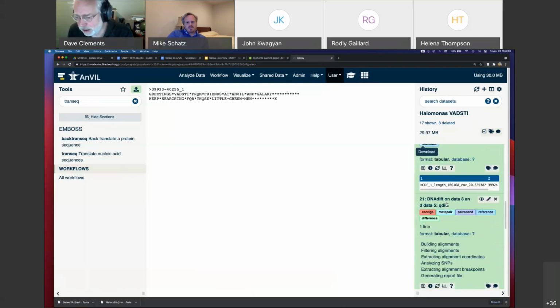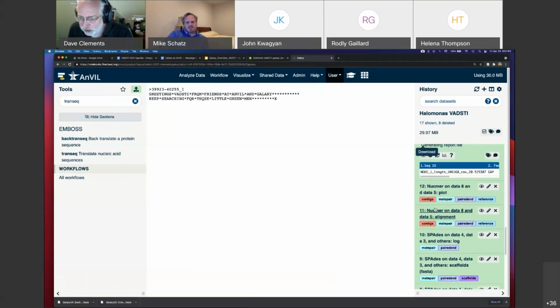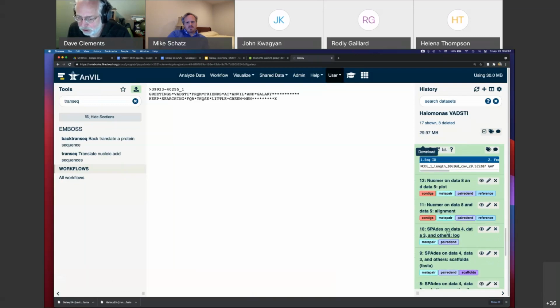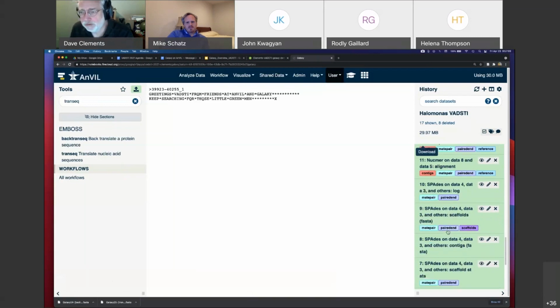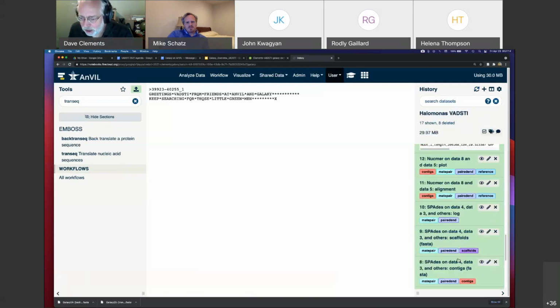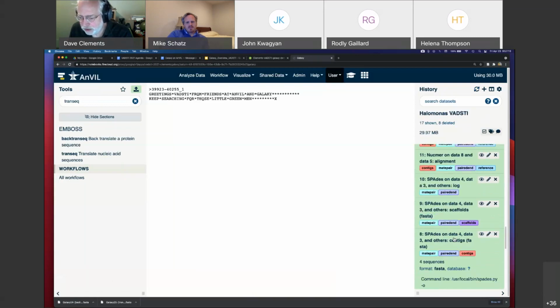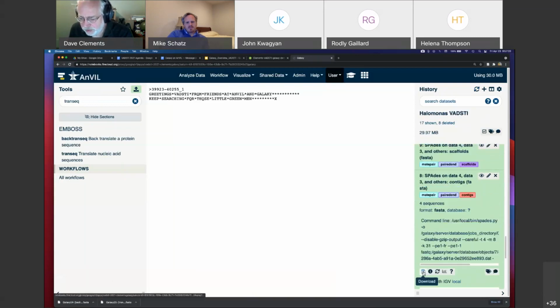And then I scroll down here until I get to the very first contigs tag, which is not there. Nuckmer, spades. Where are you? Oh, yeah, refresh. Oh, I hate that bug. Okay, right there. That's it. So I want to download that too. So I expand it and I click on that little diskette, download. And now I have my contigs and my DNA and my proteins, okay?